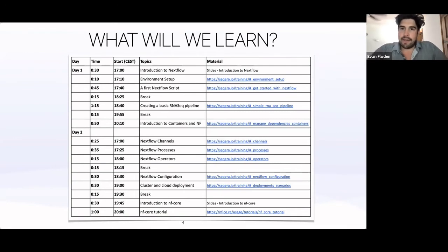We'll start off with a first Nextflow script, and we'll jump straight into understanding the nuts and bolts without maybe understanding exactly what's going on in the background, but just to get a flavor of what's happening with Nextflow. And we'll jump into a 15-minute break. In the middle section today, we will build our own RNA-Seq pipeline. You'll get hands-on experience in building a simple RNA-Seq pipeline with 4 different steps: quantification, making an index, etc. By the end of that, you should get a good flavor of what Nextflow is about.